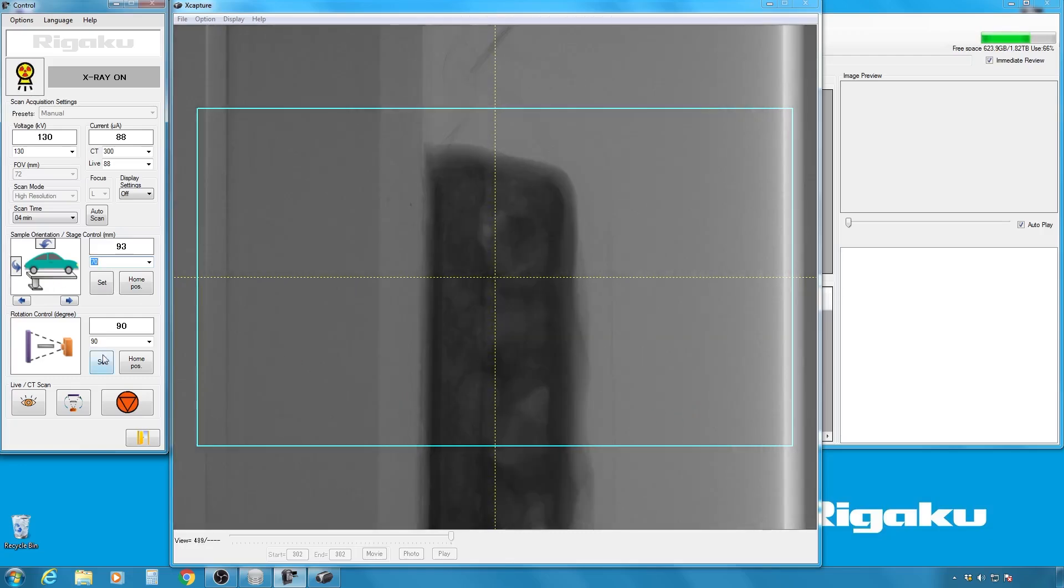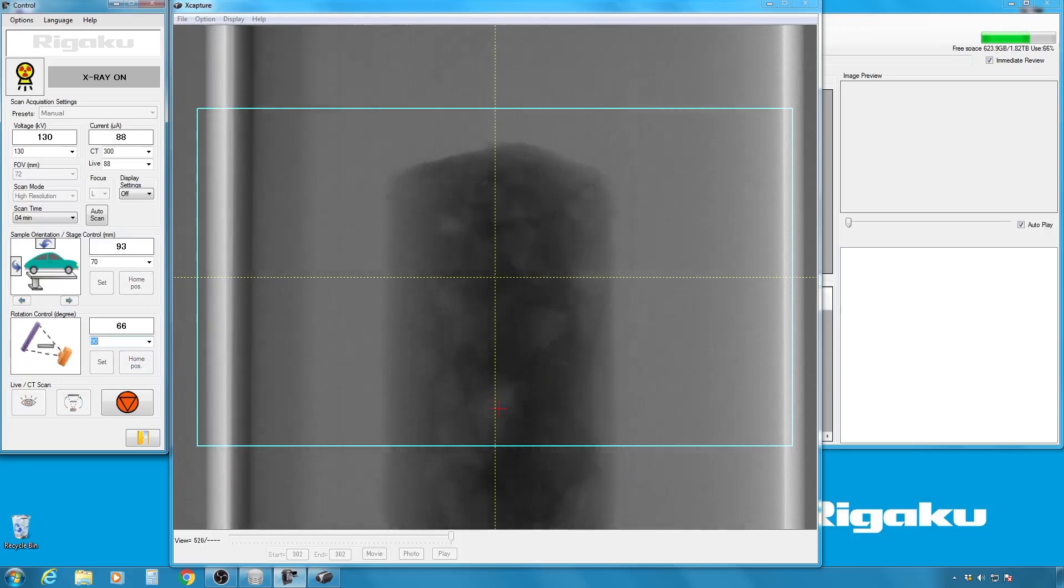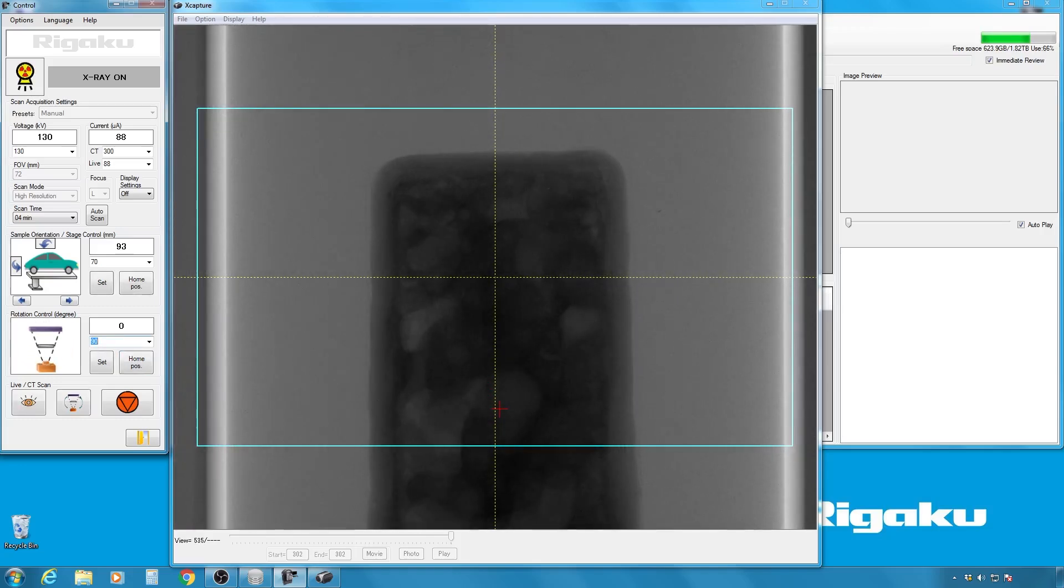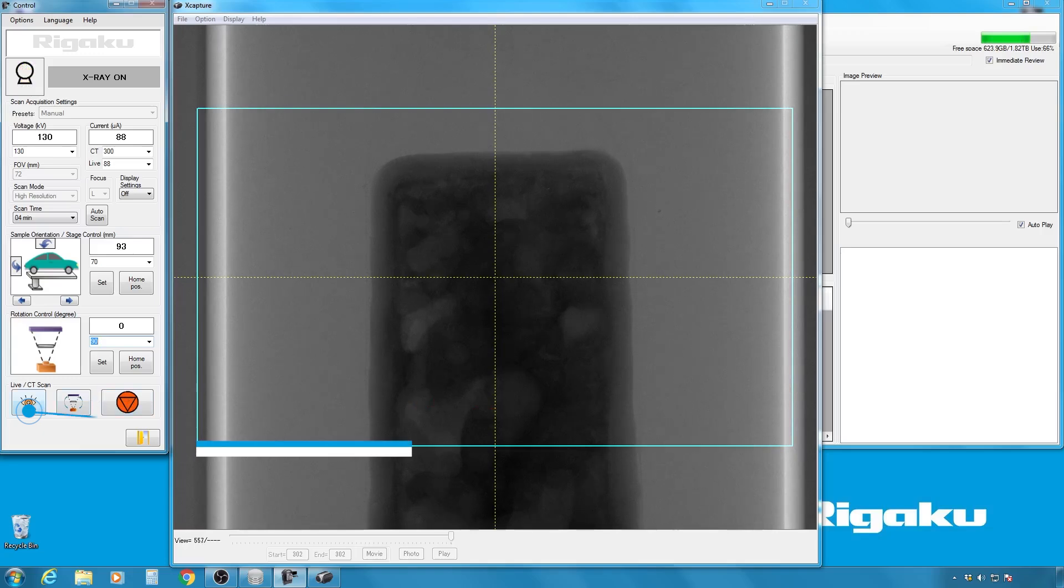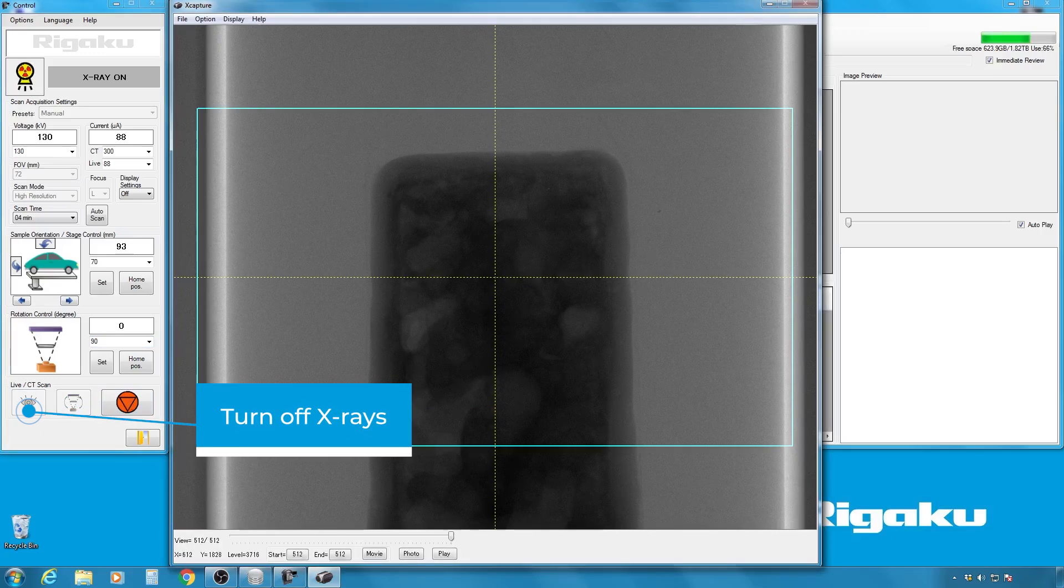And we're going to go back to zero degree. Okay, so now the sample is aligned, so I'm going to turn off the X-rays for now.